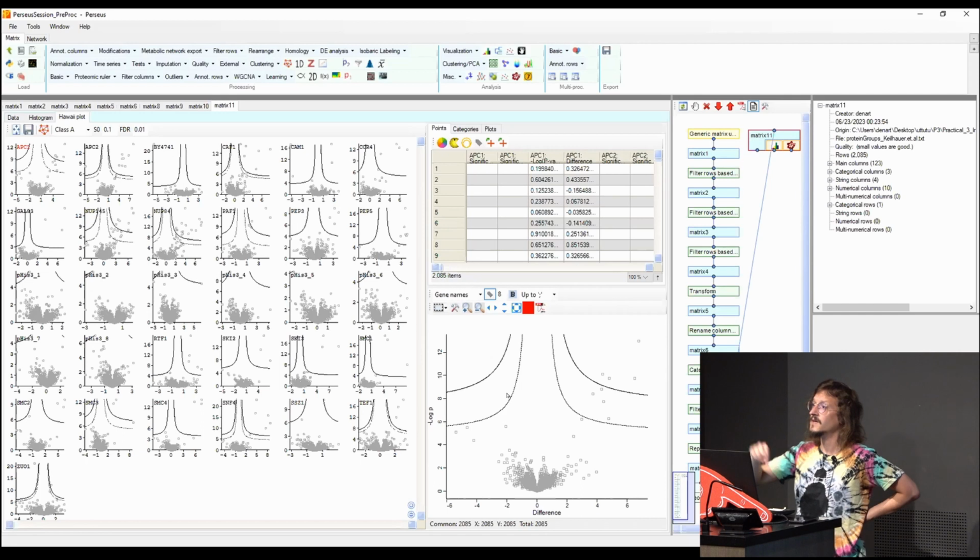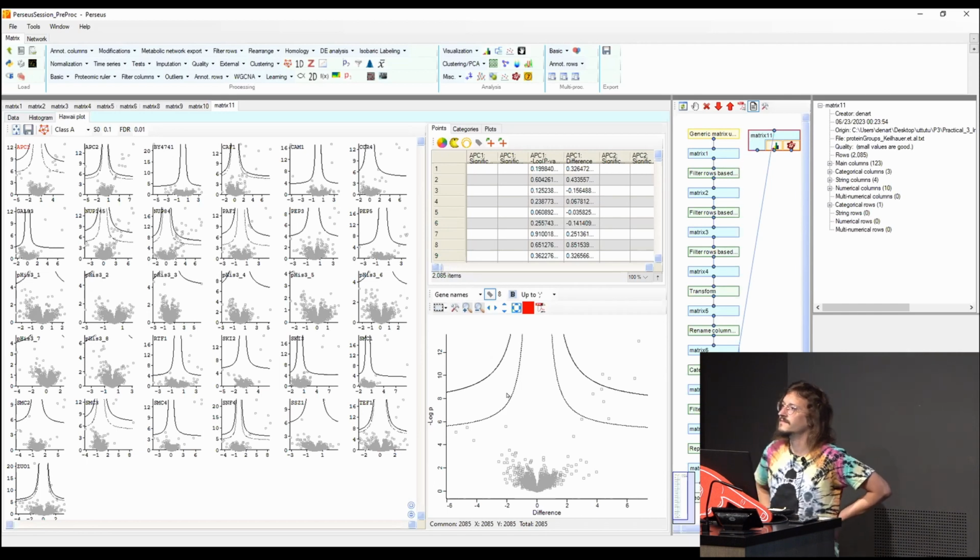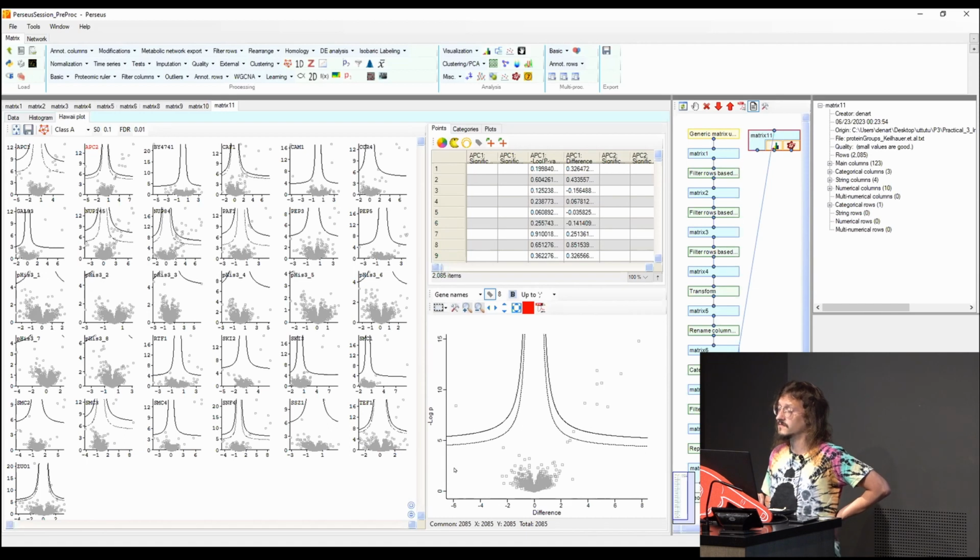Hi. Yeah, here. I actually have 2 questions. First, the x-axis, is it the t-test difference which is depicted? Yes. Okay. And then if you go to the APC2 sample, there's a negative significant value. What does this mean?